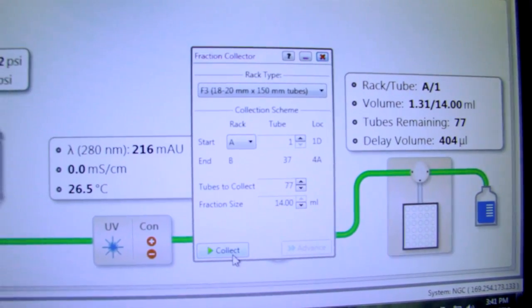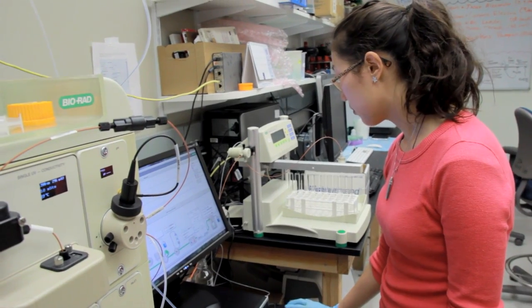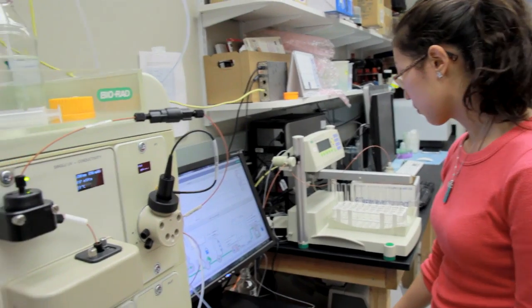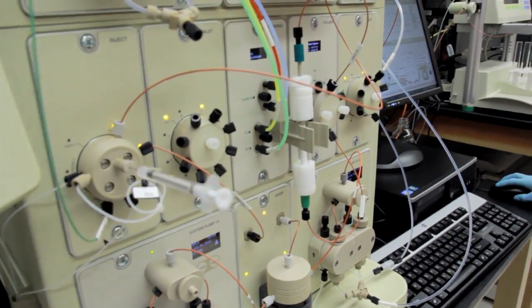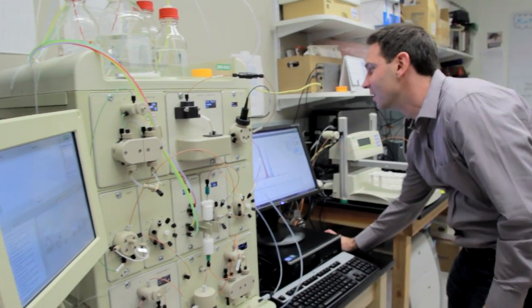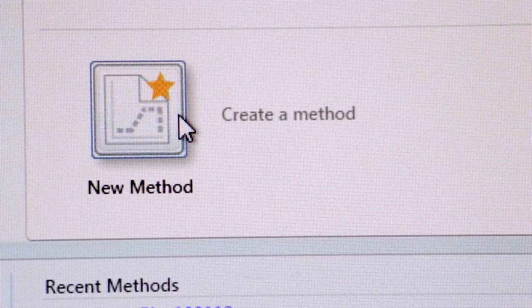That's actually a good thing for us because we have a lot of students that work in the lab, and I found it was very quick for them to understand and learn how to use the system compared with our previous system. Creating methods is really easy actually; you just drag and drop features into the method profile, and then you can follow through everything graphically.